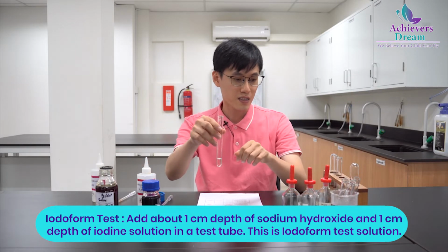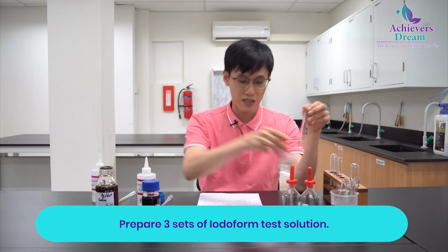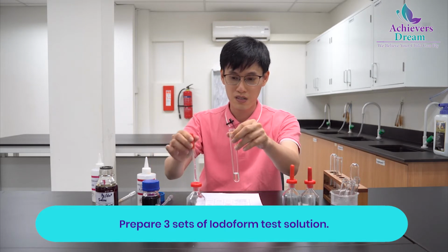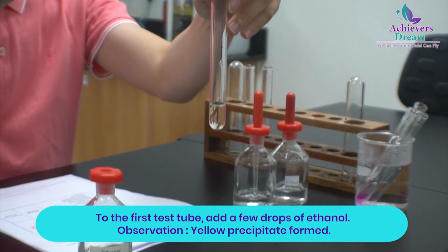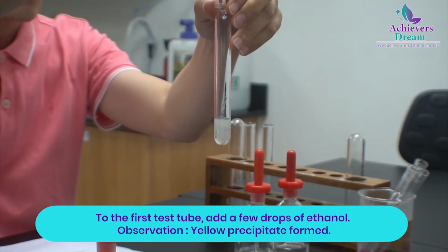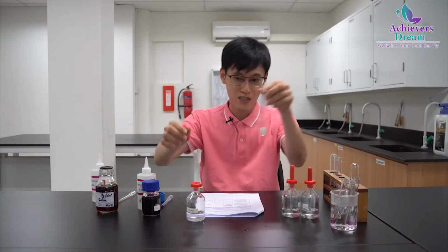After that, what we'll be doing is adding a few drops of each alcohol to the solution. So this is ethanol. Ethanol has the iodoform group, so we expect to see a yellow precipitate of iodoform appearing. Yes, look at the precipitate appearing.